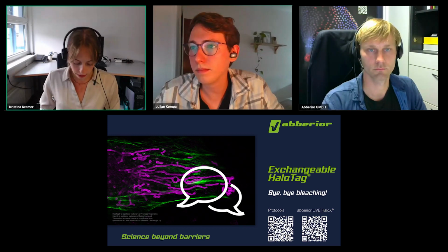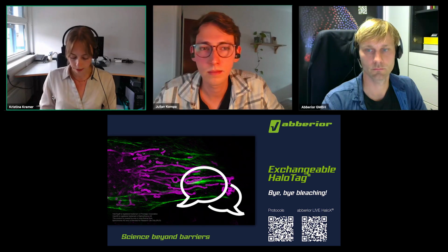Okay, thank you. So maybe we have time for one last question. There was a question if you can comment on the nuclear permeability of the HaloX probes. So I've shown a lot of images of H2B, histone 2B staining, so live cells that have HaloTag in the nucleus. So there's definitely a good permeability to the nucleus. We did not quantify this, but to me, I don't see any problem at a working concentration of 100 to 500 nanomolar to stain something that is localized to the nucleus.